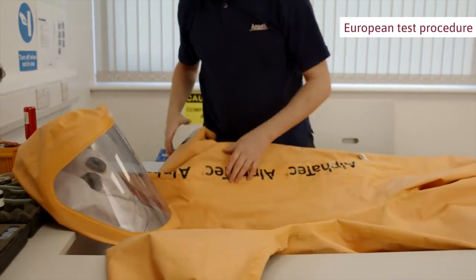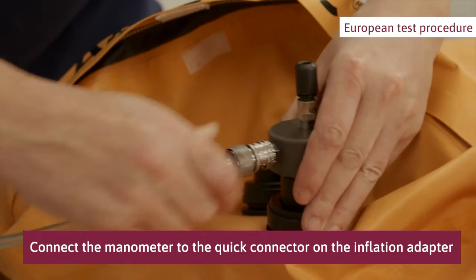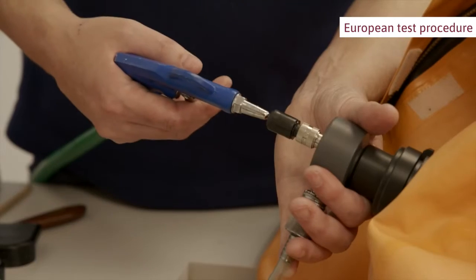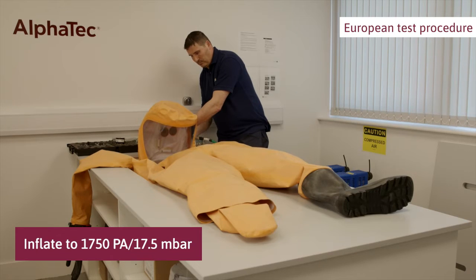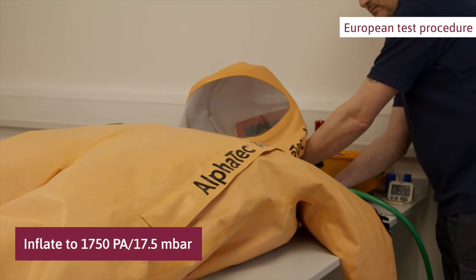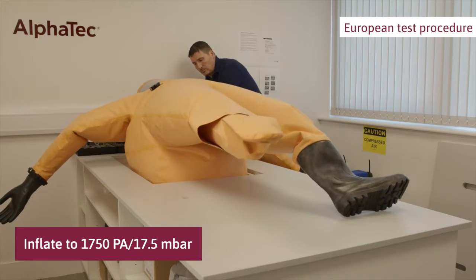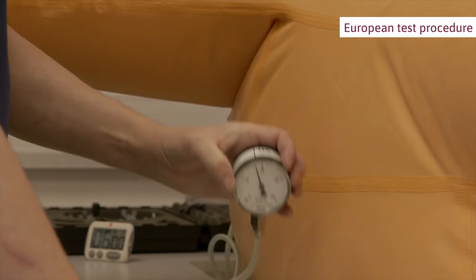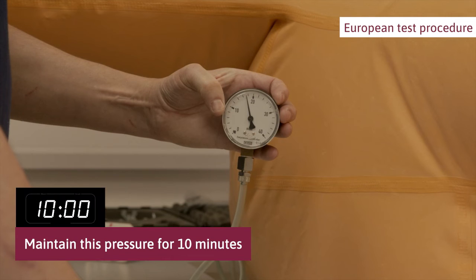Place the suit on a clean surface, preferably a table. Connect the manometer to the quick connector on the inflation adapter. Inflate the suit with an air pistol through the valve on the inflation adapter to a pressure of 17.5 millibar. Then lower the pressure to 17.5 millibar using the valve on the adapter. This is the pre-test expansion pressure. Maintain this pressure for 10 minutes in order to fill out wrinkles and allow the material to settle, adding air if necessary.